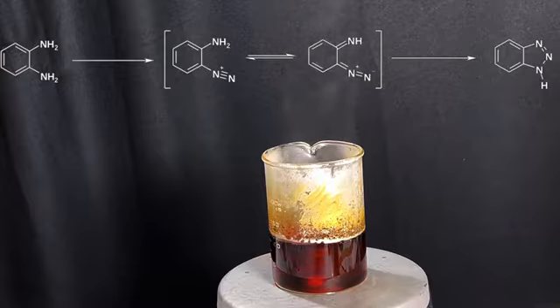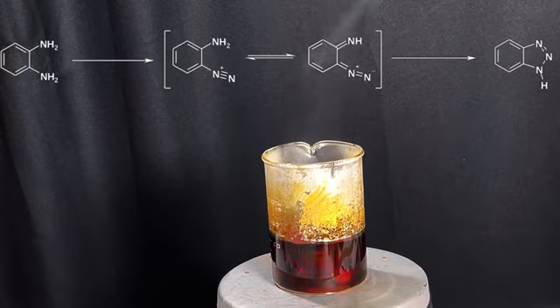The chemical equation for the reaction that is taking place is shown on the screen. Nitrous acid is generated in situ by the reaction of sodium nitrite with acetic acid. This nitrous acid reacts with orthophenylene-diamine to form an intermediate monodiazonium salt, which immediately cyclizes to form the product.